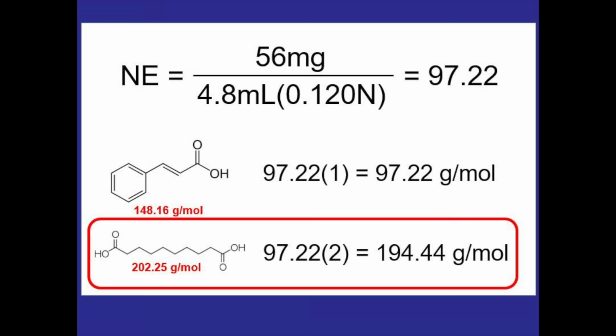That's kind of up for the student to decide. So once we have the data for the acid as well as for the alcohol, we're going to make our best educated guess based off of how things went in the lab. Once we think we know which compounds we have, we'll write those in our conclusion along with the reasons why.